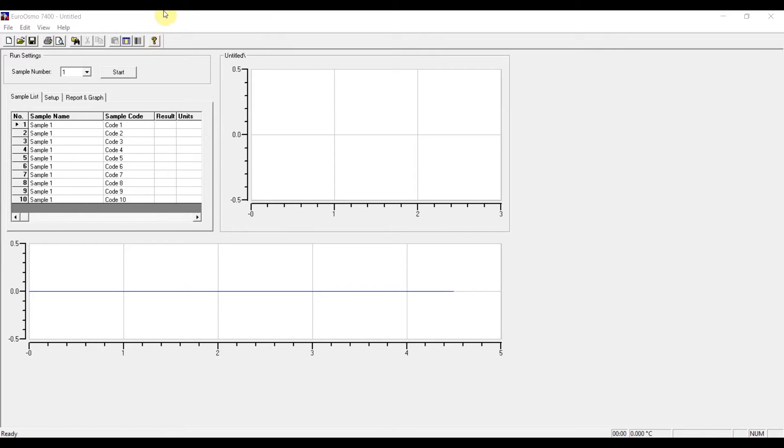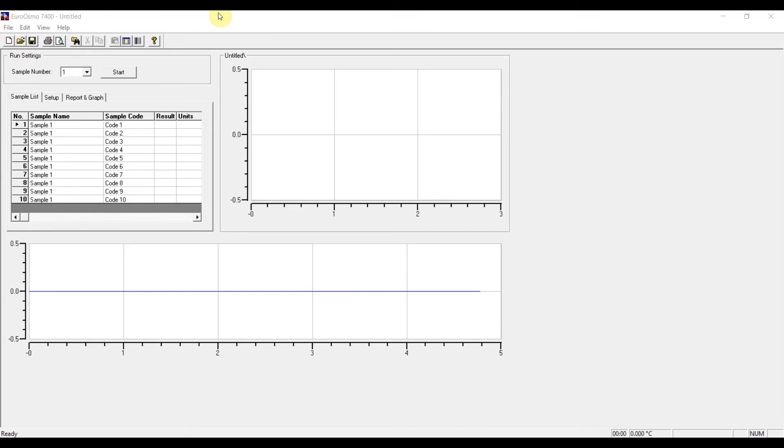Here on the top we have the basic tabs that you know from most software, and you also have some quick buttons. I'm just going to run through the basic functionalities or the basic components of the software so that you get an overview.